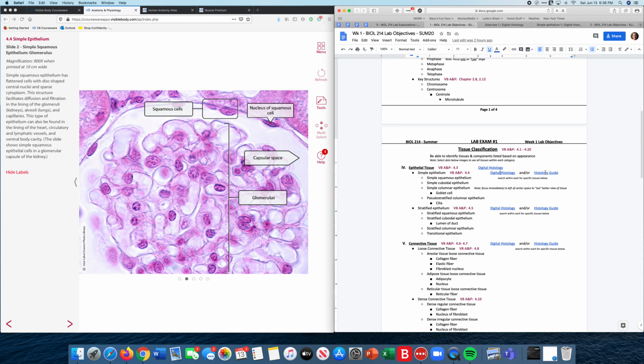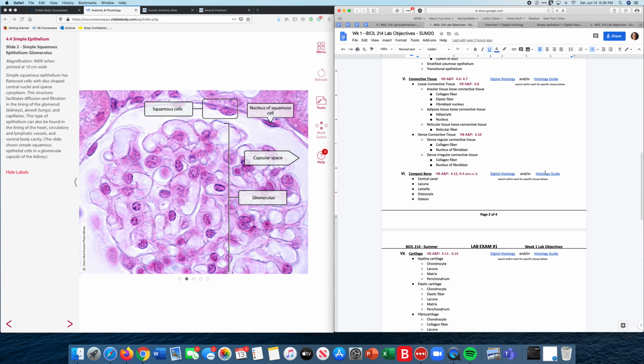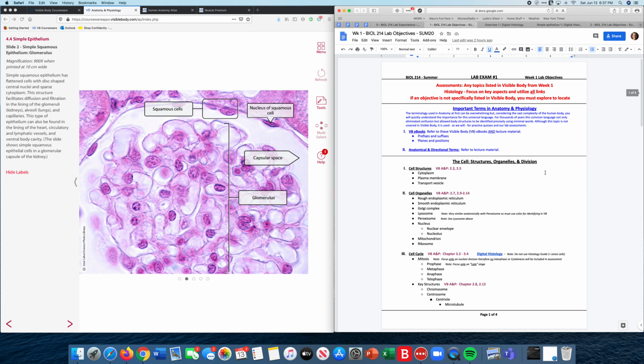You've got a nice representation of the illustration. It's one cell thick, simple squamous epithelial. Once you know it and see it, it's always going to look the same, regardless if you have a purple stain or a blue stain. It doesn't matter. So don't wig out about that, okay? I think that's it, what I needed to show you, and make sure that you dig into that histology tissue and not just assume that's the first one. Just go deeper and see what you can find out.